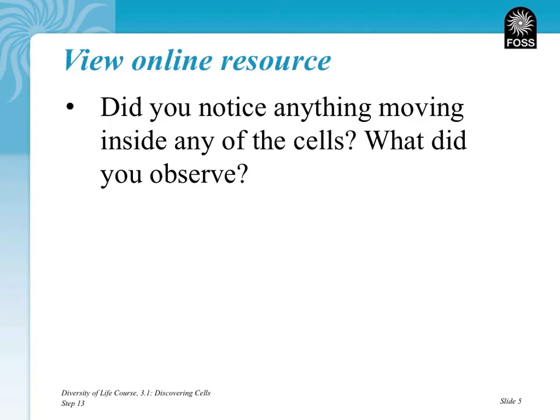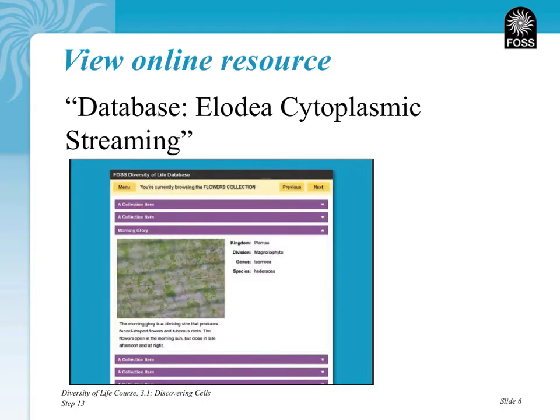The second thing was the actual live version you were looking at, if you were looking at those here in the classroom: did you notice anything that was moving inside the cells? What did you observe? If you need help with that, there's a section in the FOSS-Web database called Cytoplasmic streaming that shows an actual movement of the materials inside of those Elodea plant cells. Let me show you. Here's what I'm referring to.